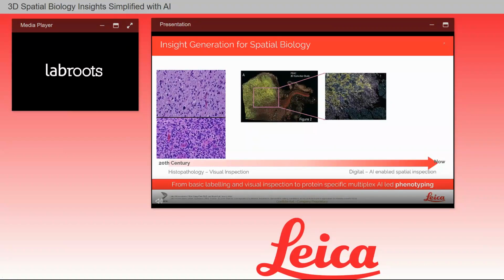inspection for getting insights. In this example of pancreatic tumor section, we have analyzed a 2D multiplex image with 30 channels and millions of cells with the spatial biology tools available in Aivia. In image A, we have two different types of tumors present in this section. In image B, we used a modified version of Cellpose's deep learning algorithm that was optimized for large 2D multiplex images to accurately segment cells.